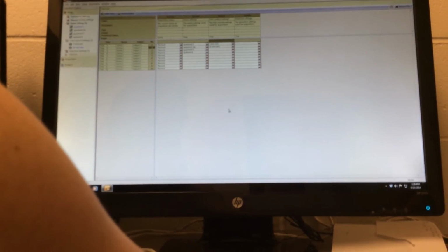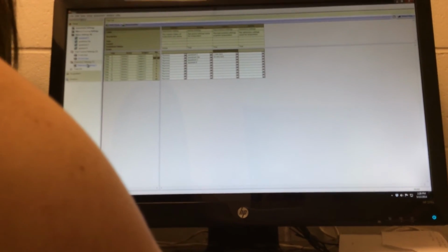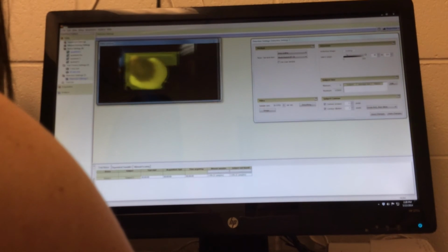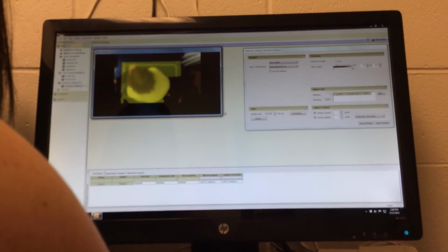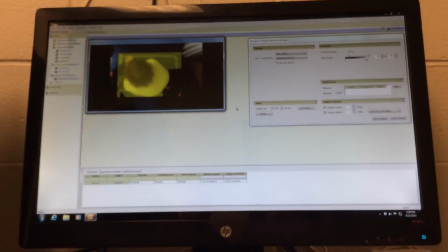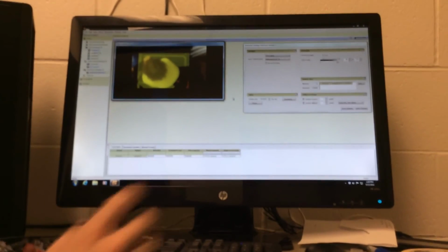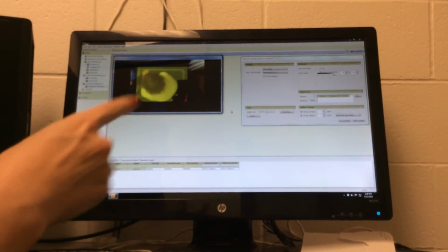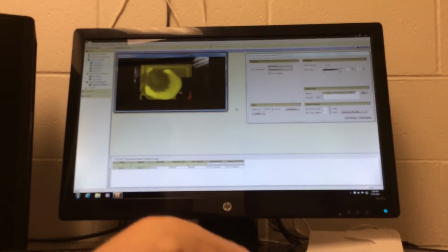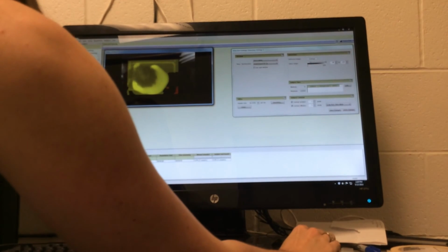Okay. And I noticed in, I believe it's the detection settings, there was a place where we could actually outline the shape of the object. Yes. So, just as she's got a restraint tube that she's concerned with, what I would do is, when you take your background image in the arena settings, have that tube be in there and designate it as a zone. So draw a shape around it and call it tube or whatever.